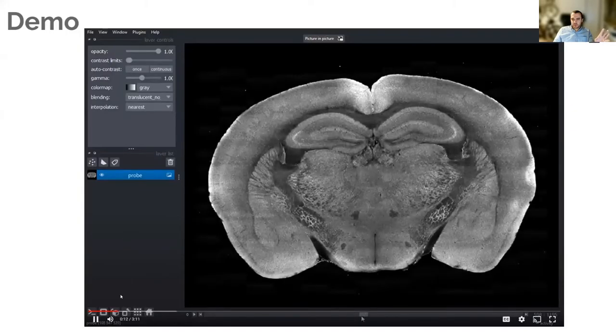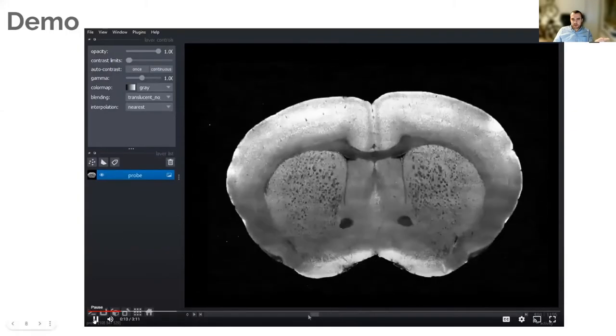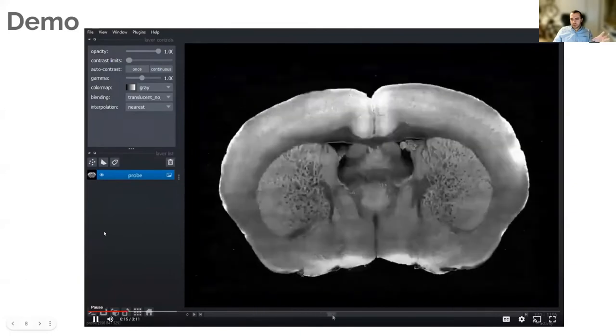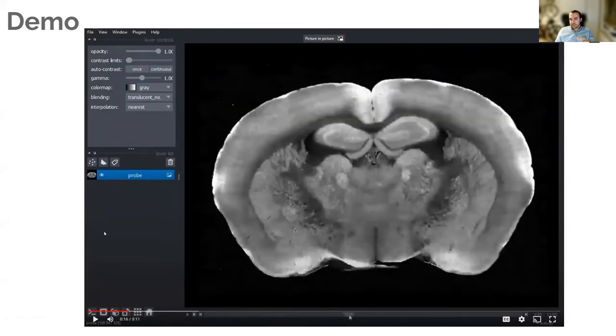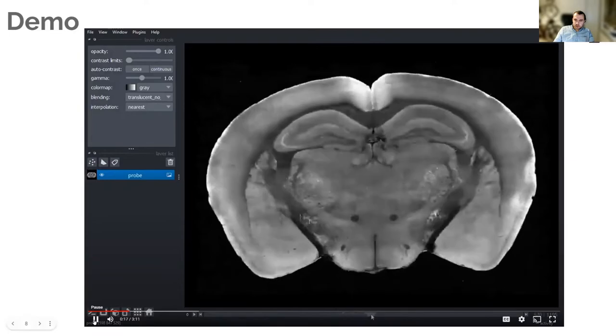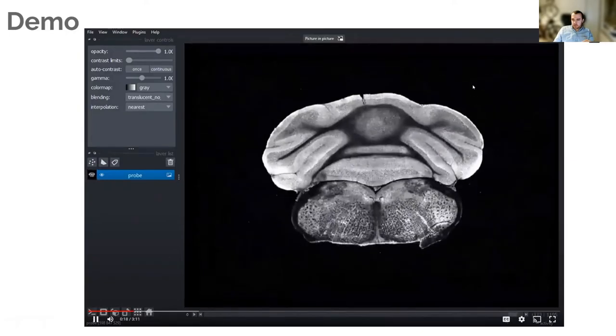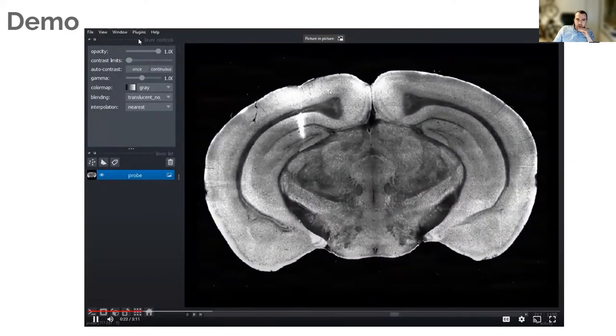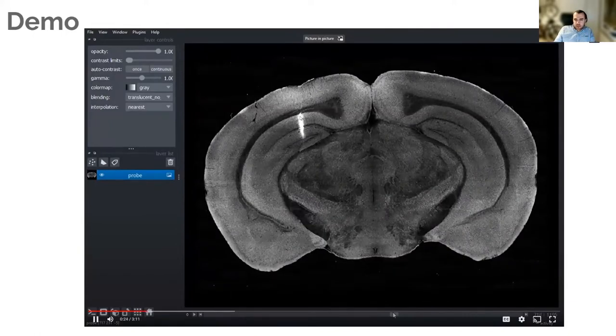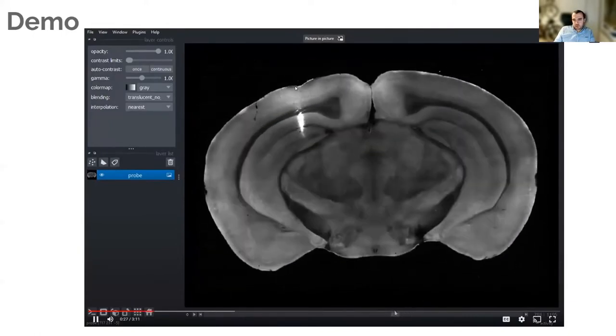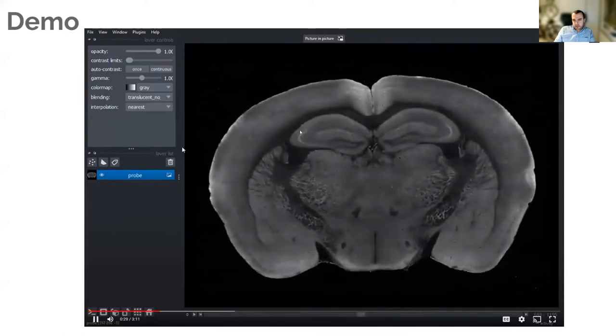Our tools are all available as plugins for Napari. If you're not familiar with Napari, it is a multi-dimensional image viewer written in Python. It basically sets out to be a bit like ImageJ but to leverage the image analysis and machine learning capabilities of Python. So you open up Napari, which you can download on any operating system, then drag your raw data into Napari. In this case, this is a 3D whole brain serial section image of a mouse brain. And if we play with the contrast, we can see there's a probe track here in 3D going through visual cortex and hippocampus—this is what we want to segment out.